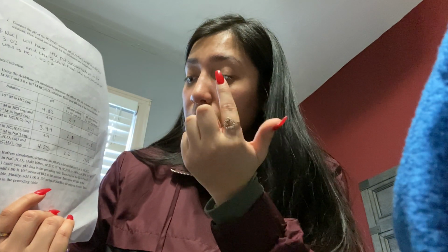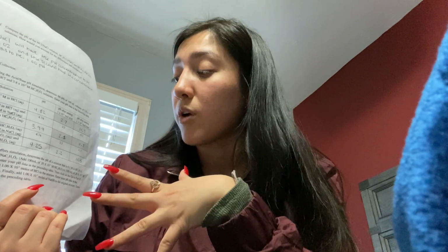We also answered the questions that they asked, and we also compared certain chemical equations that they wanted us to, like HC2H3O2, and how much time it took for the acid or buffer to change the color of the solution. Then he gave us another data table right here, and it had some inputted values for the pH after adding 1 times 10 to the minus 3 moles of acid or base, and we had to make sure that the pH would go up or down. I believe that if it was around 2.7 to 2.2, it would either stay around 4.8 or 4.2 and then go down to at least 3.9, which was probably the lowest pH balance. Later on, we analyzed and interpreted the data to compare the actual things.